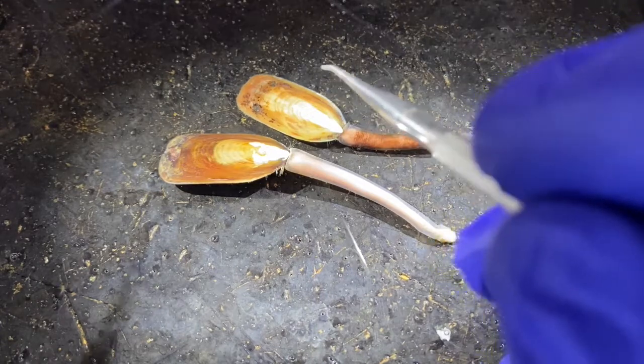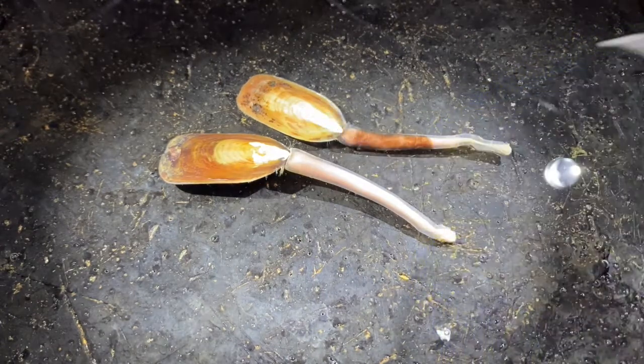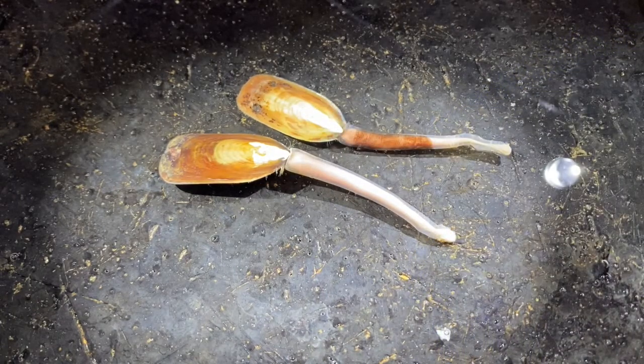As you can see, they are shelled organisms. They are bivalved, but they are not bivalves. Bivalve mollusks have shells that are right and left-handed. And in brachiopods, the shells are dorsal and ventral. And it's not easy to tell which is dorsal and ventral in this particular species until you open it up.